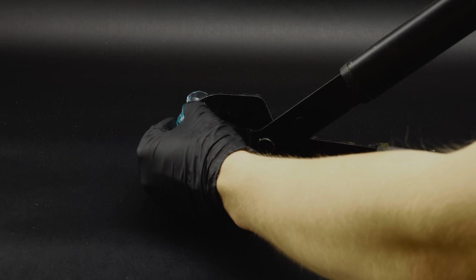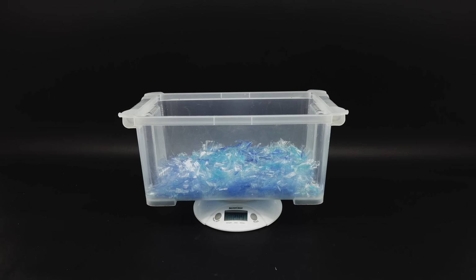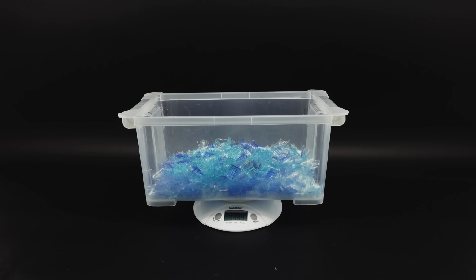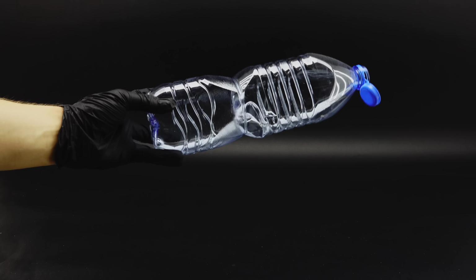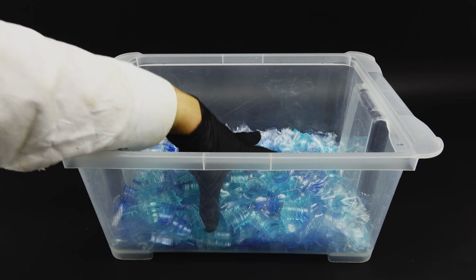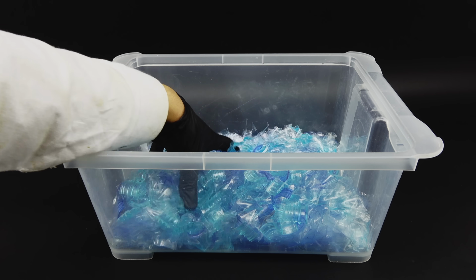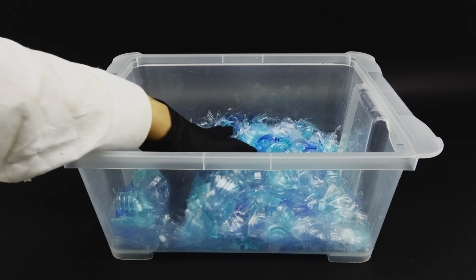As expected, this was a big pain, and the only tool capable of splitting them was this massive tree pruner. It allowed me to finally reach my target 400 grams of cut PET plastic, and I also had to use a few of these darker colored bottles, since the 20 I started with weren't quite enough. Anyway, with this very hard-earned box of laboratory-grade plastic ready, I could now finally extract the benzene from it.